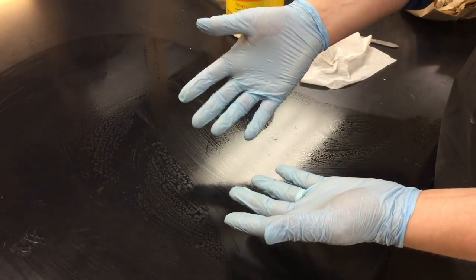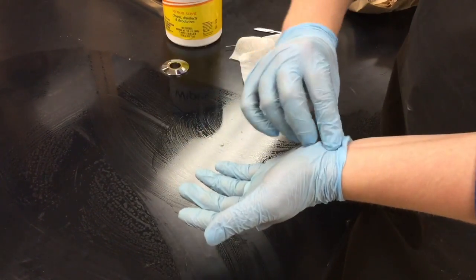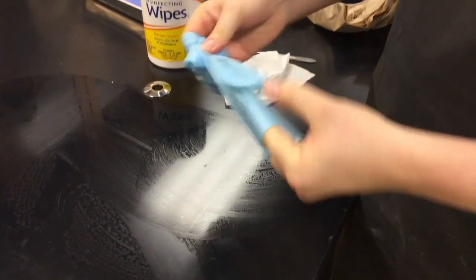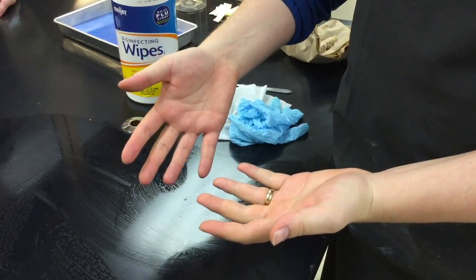Now that you have everything finished, it's time for you to go ahead and take off your PPE. Be very careful as you are taking off your gloves to make sure you do not come in contact with your skin. And make sure to go and wash your hands or use hand sanitizer.